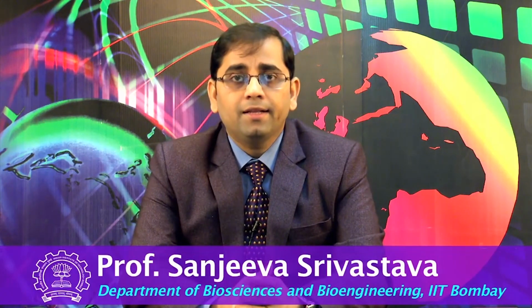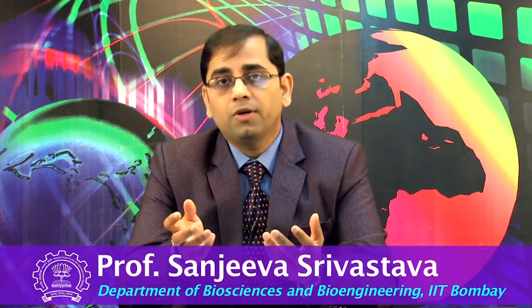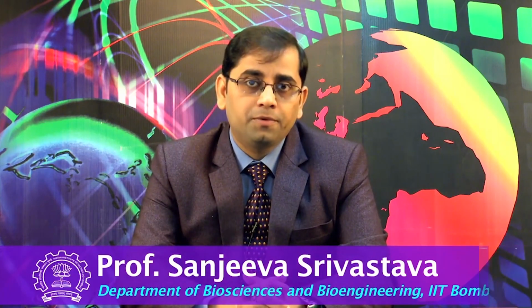Welcome to MOOC course on applications of interactomics using genomics and proteomics technologies. As you have seen, nucleic acid programmable protein arrays or NAPPA is a very robust technology where many applications can be performed. You have seen Dr. Josh LaBaer discussing the advent of this technology and various types of applications which could be performed on these arrays. However, the nature of microarray experiments is such that you have to perform a series of steps before you can make any meaningful signal or sense out of the data.